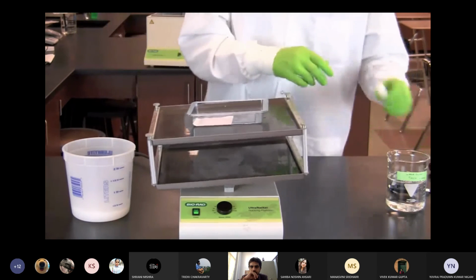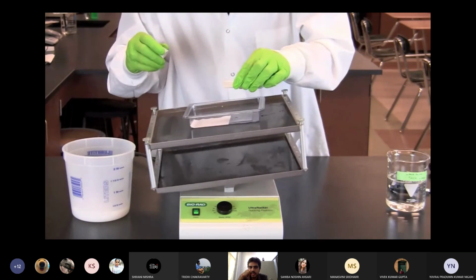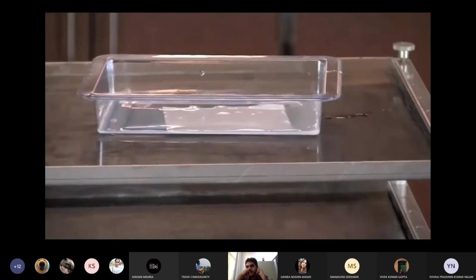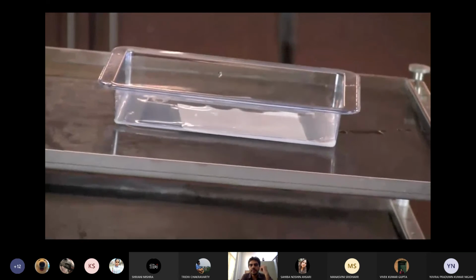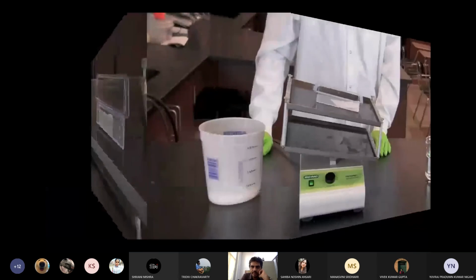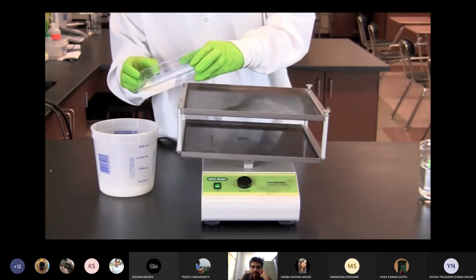Add 10 milliliters of secondary antibody. Now after the washing is over, then you need to add the secondary antibody. The secondary antibody, as mentioned, is going to be incubated at a fast speed. The label on your secondary antibody is either chromogenic, radioactive, or fluorescent. Pour off the secondary antibody.